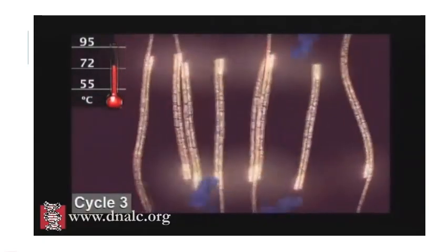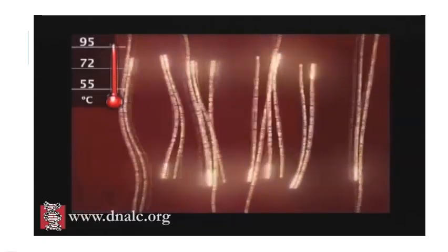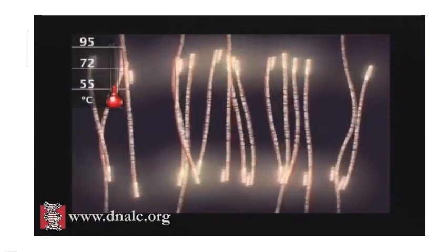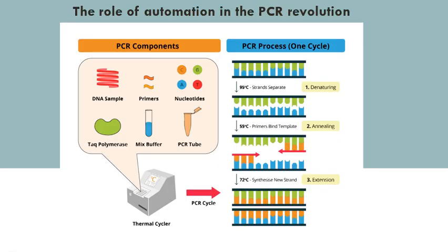After 3 cycles, the target sequence defined by the primers begins to accumulate. After 30 cycles, as many as 1 billion copies of the target sequence are produced from a single starting molecule. So as you saw in the video, each step of the PCR needs a certain temperature, so the process can start from the denaturation, the annealing, and the extension.